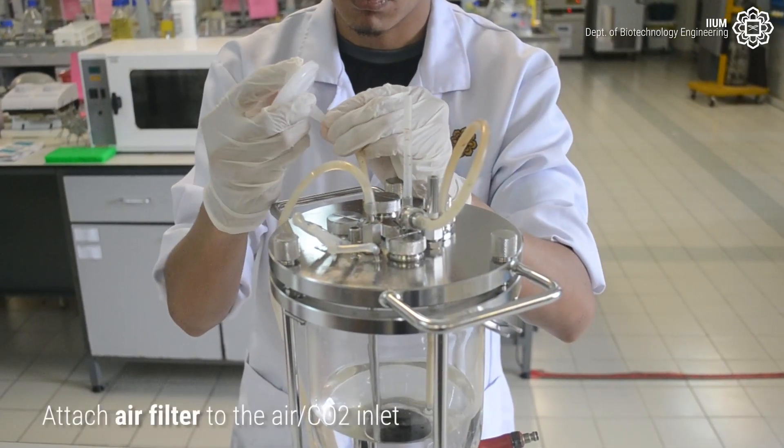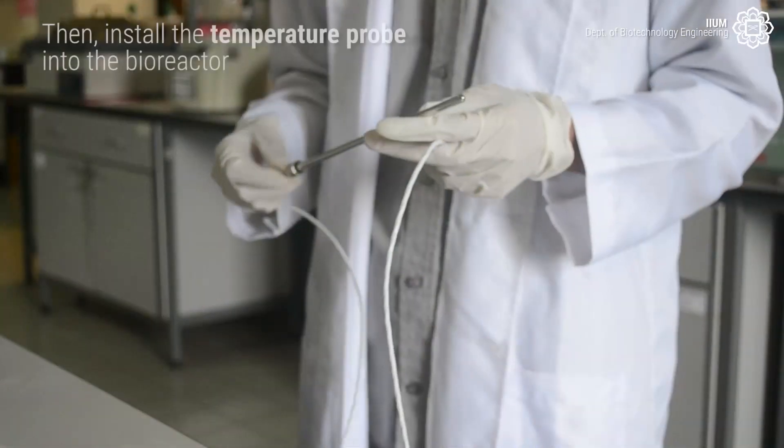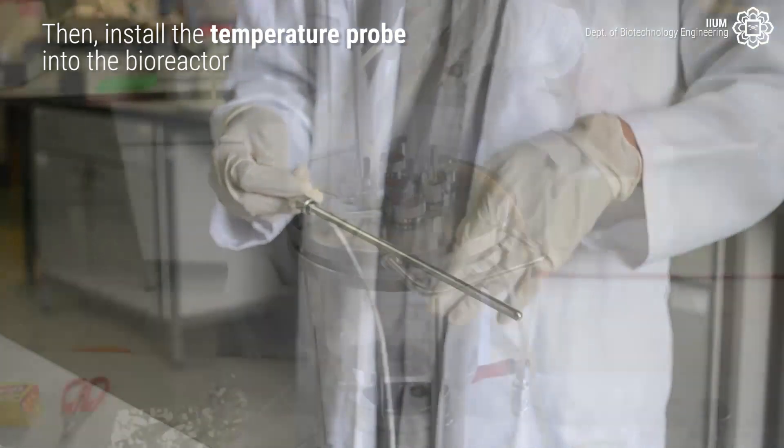Attach air filter to the air or CO2 inlet. Then install the temperature probe into the bioreactor.